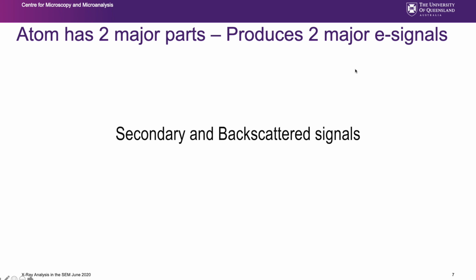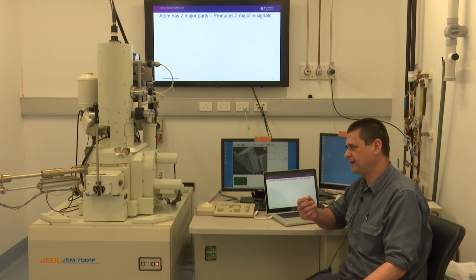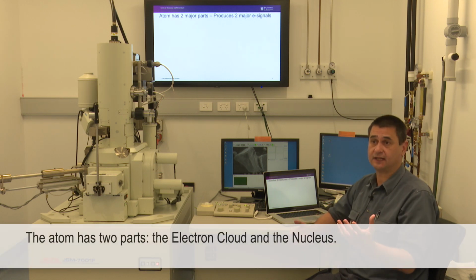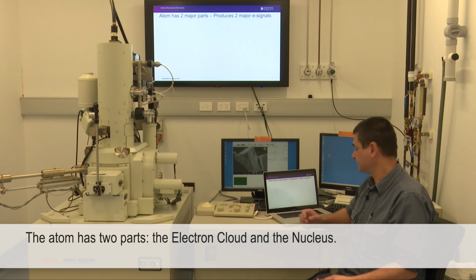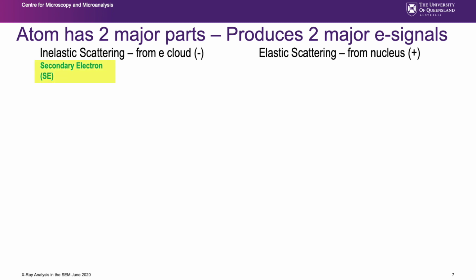So the question is, why two signals? Well, the reason is, the atom is basically divided into two parts, the electron cloud and the nucleus. And we get inelastic scattering from the electron cloud, and we get elastic scattering from the nucleus. These inelastically scattered electrons are called secondary electrons, while the elastically scattered electrons are called backscattered electrons.